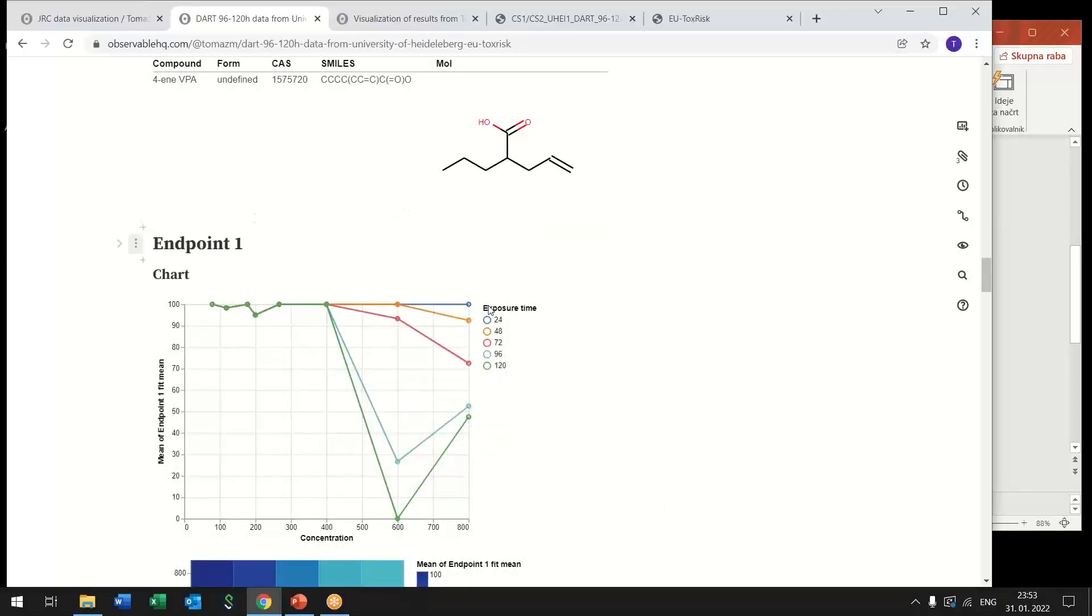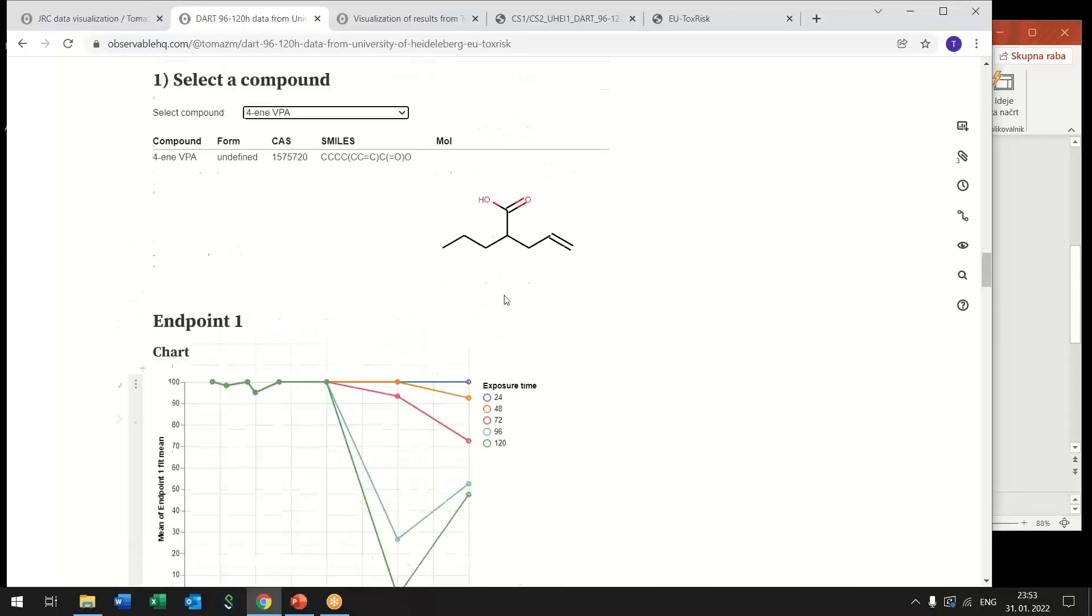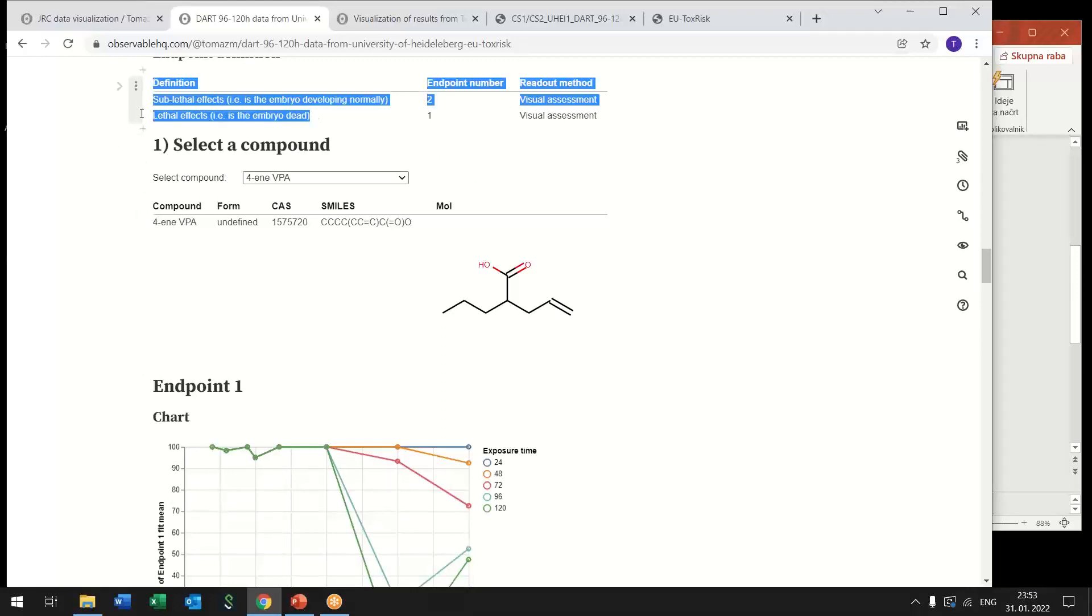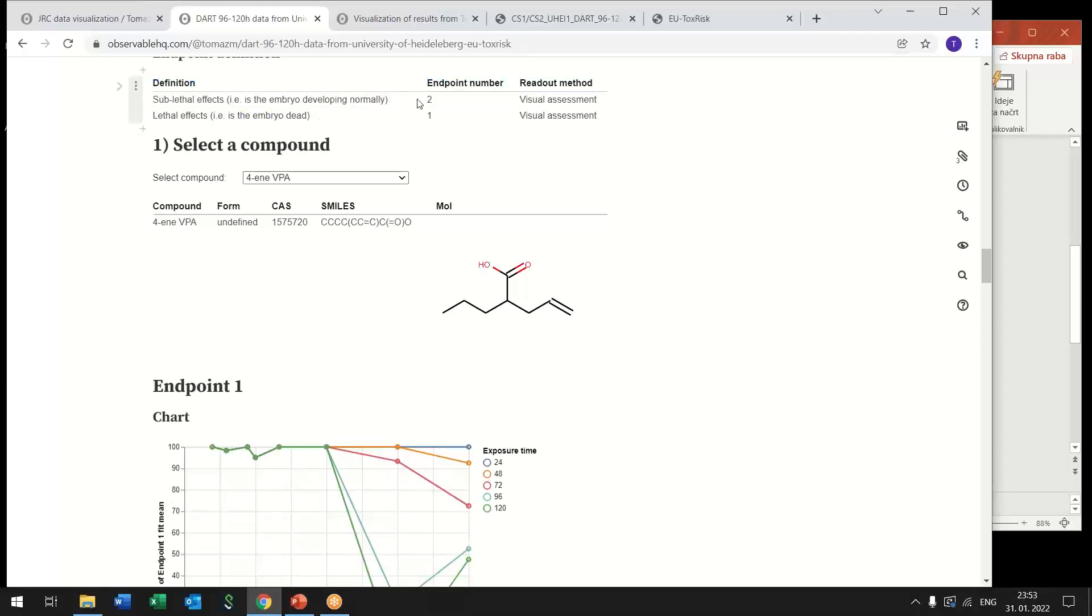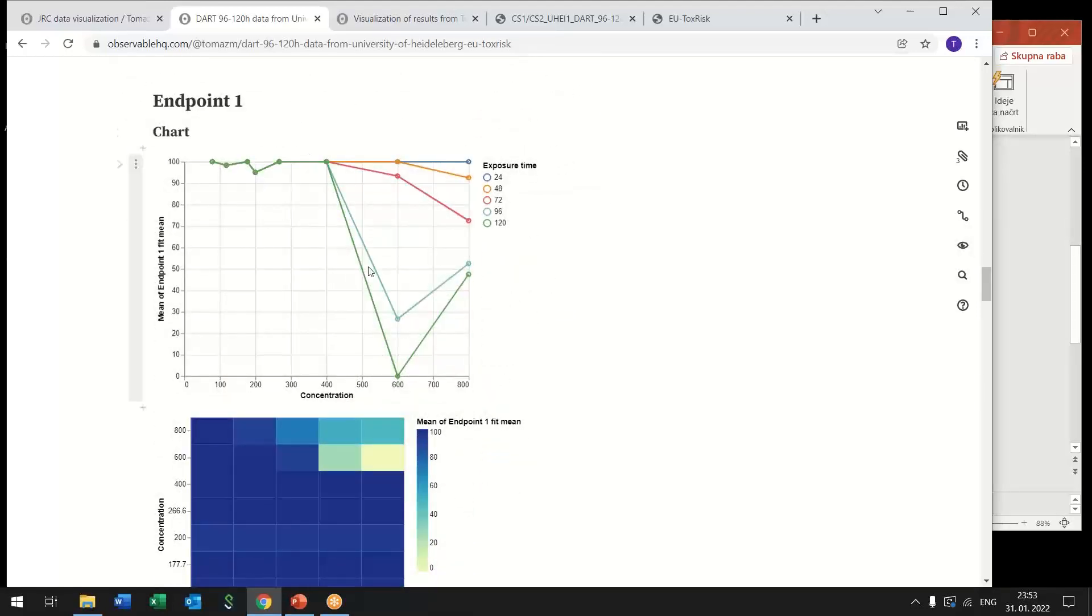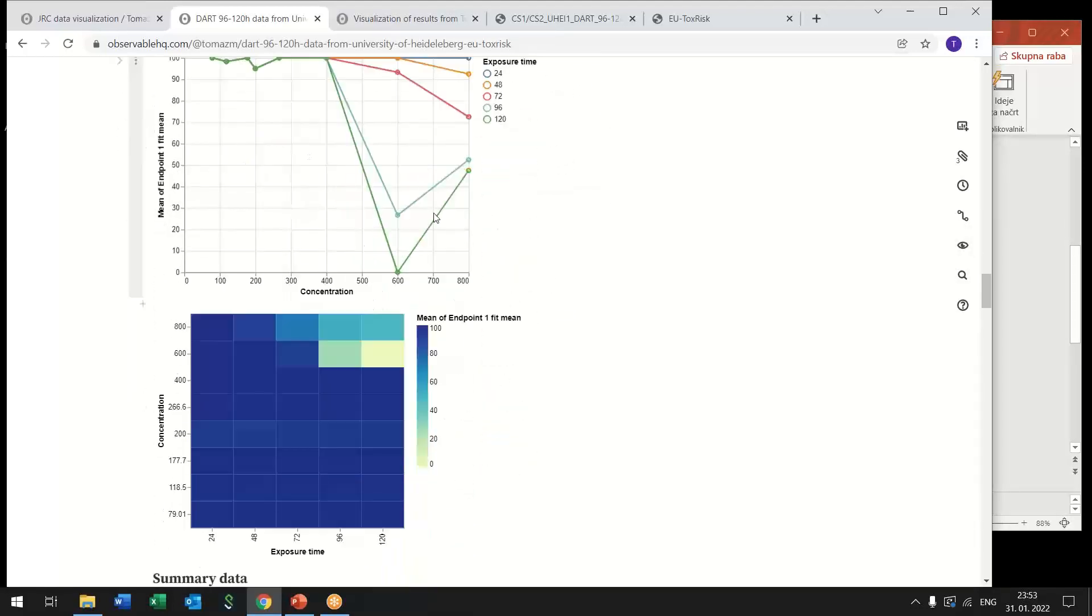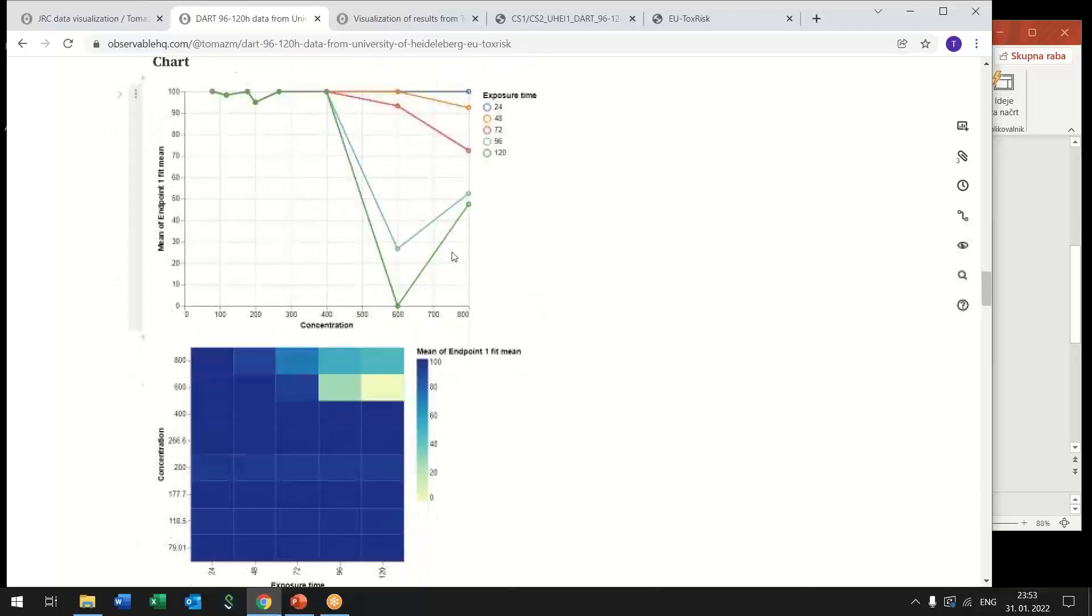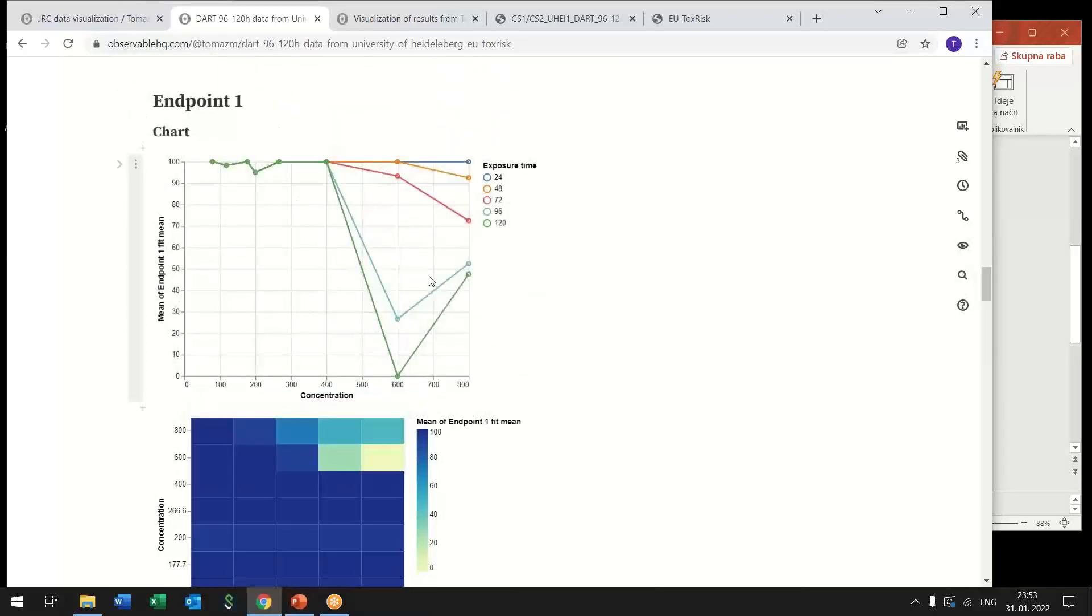Again you get the structure of the compound updated directly from the SMILES and below is the actual data. So here in this assay there were two endpoints that were measured so endpoint one responds to lethal effects and endpoint two to sub-lethal effects and here we have first line charts or heat map representation of the first endpoint.